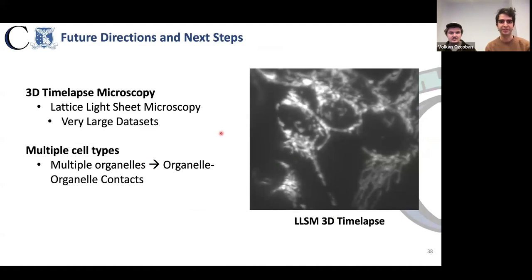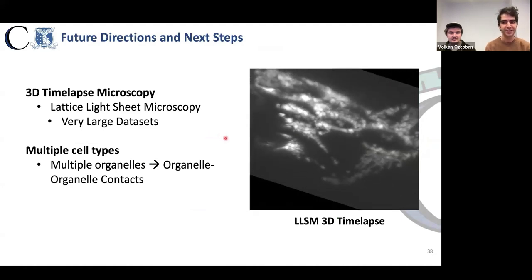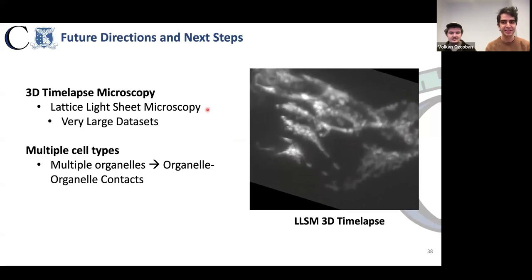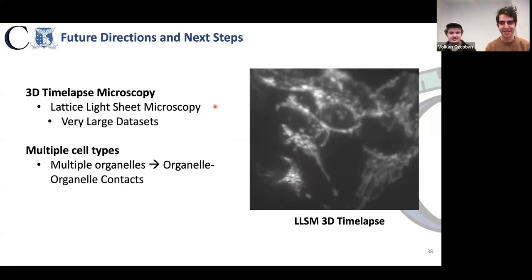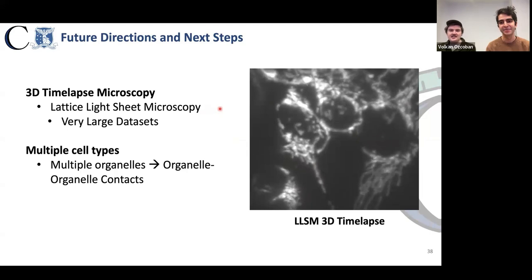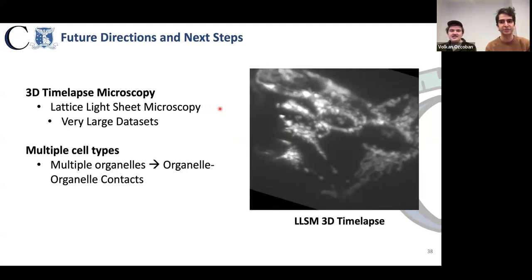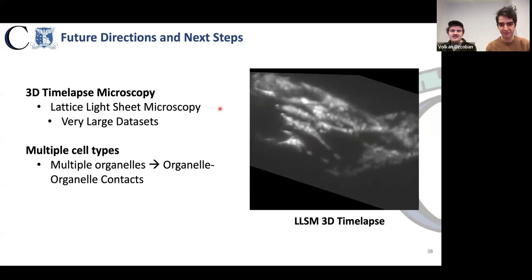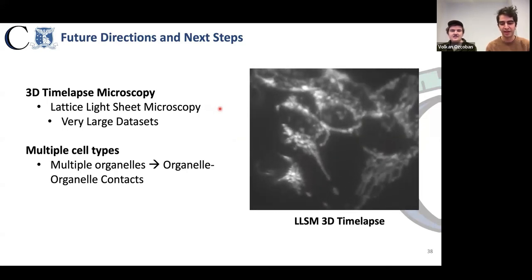And so finally, we believe that one of the most promising future directions for this approach is obviously 3D time-lapse microscopy. These data sets, again, are very difficult to handle and time-consuming to manually annotate. So this makes synthetic data-driven approaches even more valuable and attractive to the biological image analysis community.